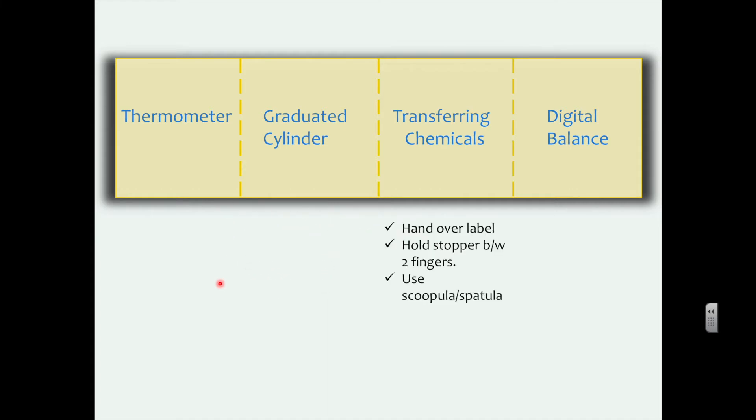Now for transferring chemicals, you want to put your hand over the label, hold the stopper between two fingers, and use a spatula or scupula. That's if it's a solid. Now if it's a liquid, you will obviously pour instead.